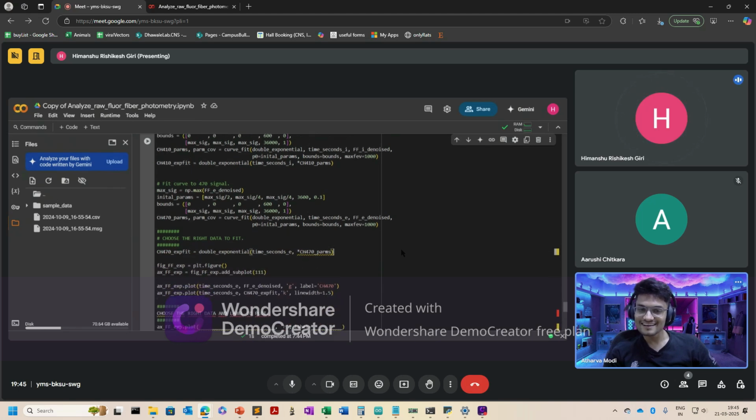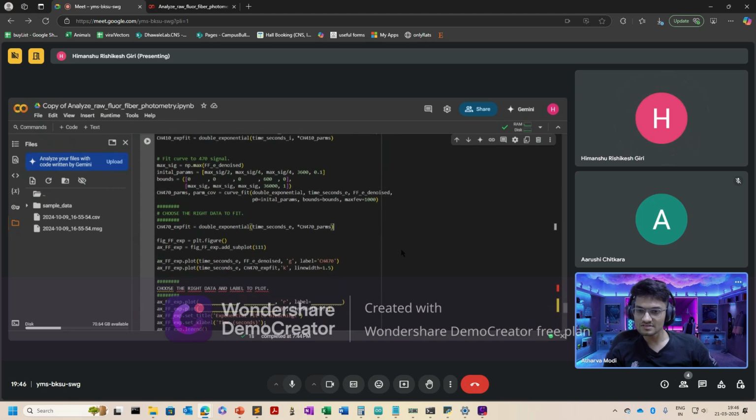For excitation, it is done. Now you have to do it for isosbestic.